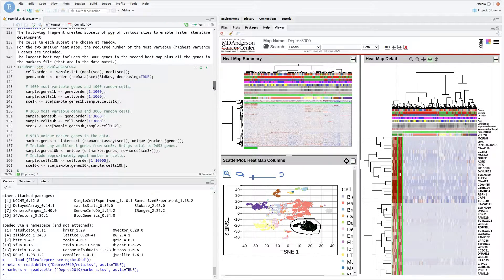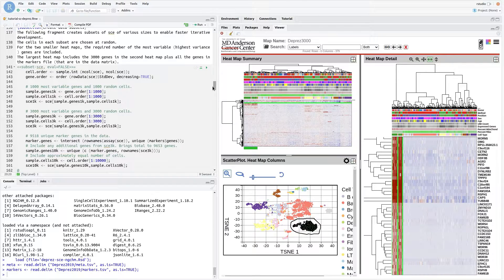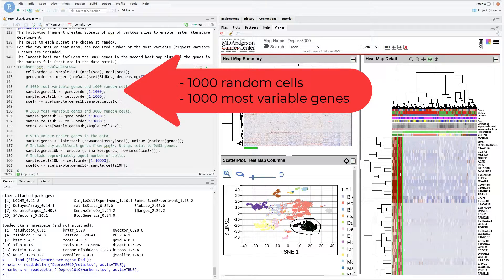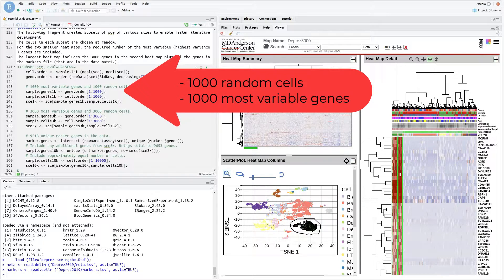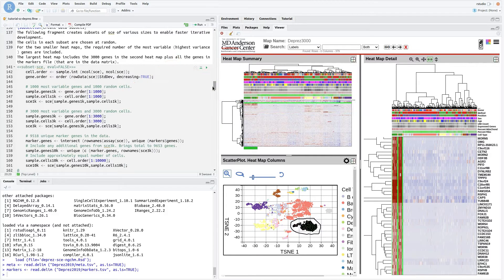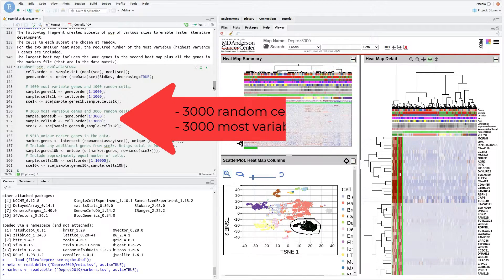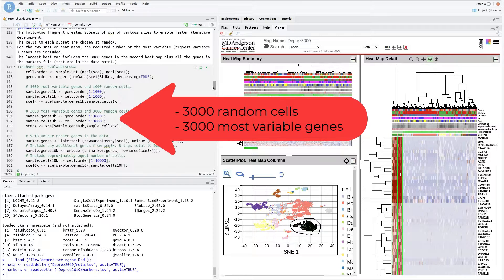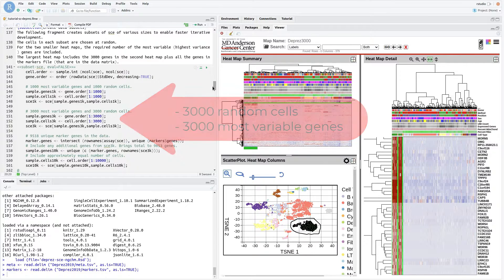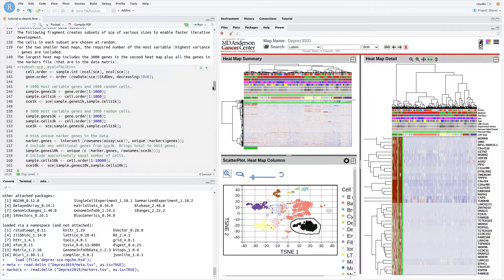To speed up development and testing for this large dataset, we create a series of progressively larger subsets of the data. The first contains just 1,000 randomly selected cells and the 1,000 most variable genes. The second contains 3,000 randomly selected cells and the 3,000 most variable genes. This is the heat map displayed at the right.